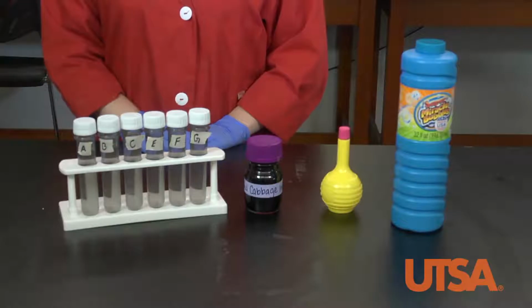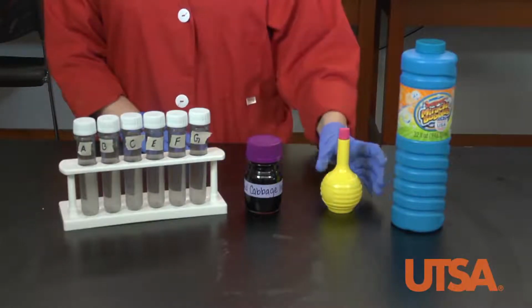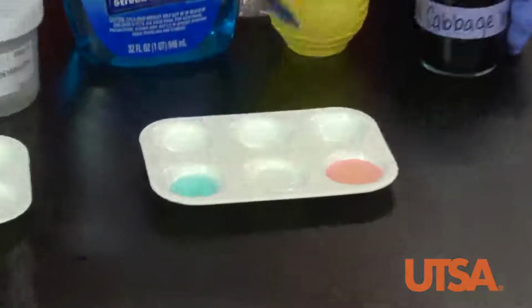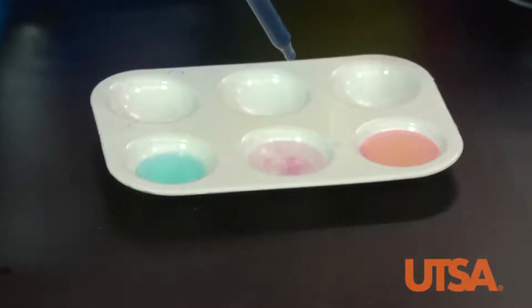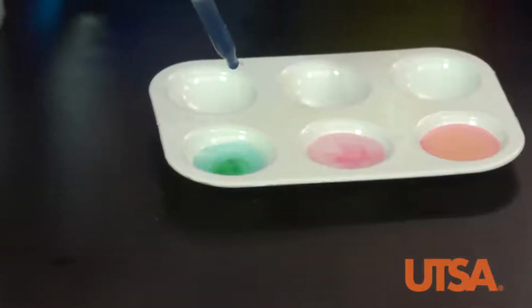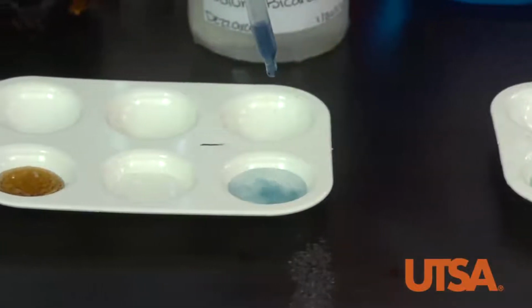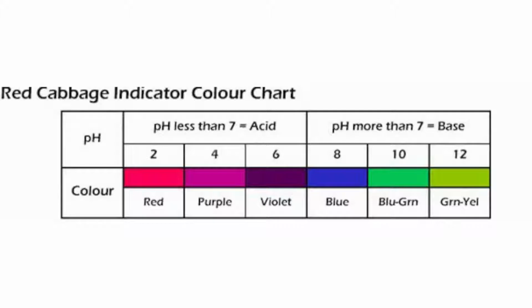You can mention that most acids will have a sour taste, while bases will have a slippery consistency. After predicting the approximate pH of the liquids, the students may test the liquids using the prepared red cabbage indicator. They can then compare the color on the provided pH scale to their prediction and update their observations.